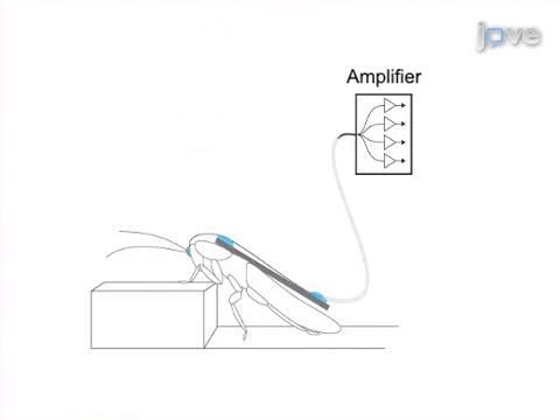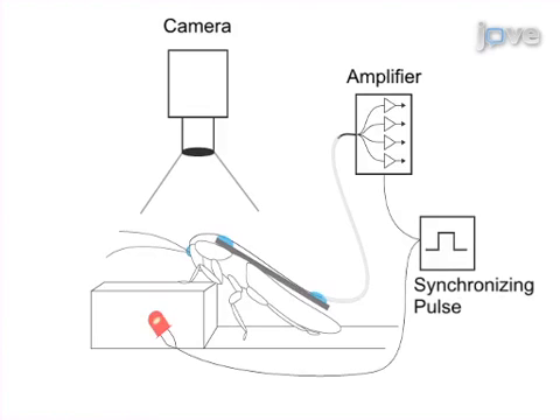Next, neural activity is recorded along with video recording of locomotor behavior. The video is synchronized to the recording by a synchronizing pulse to an LED and the amplifier.